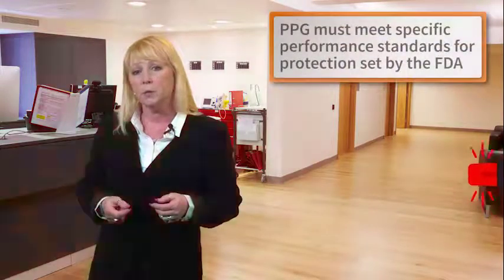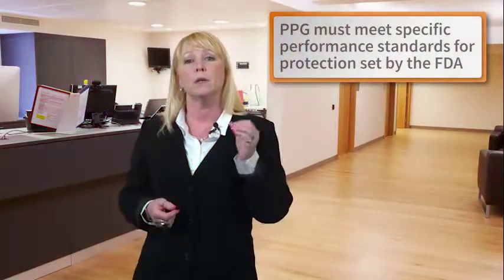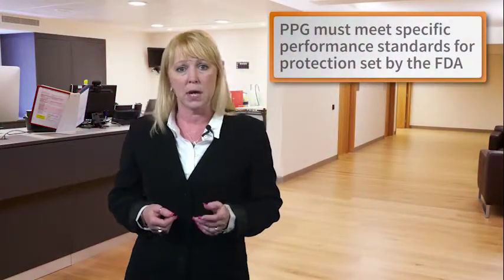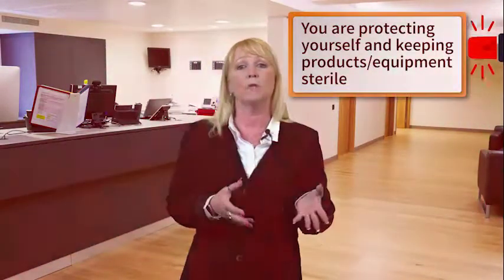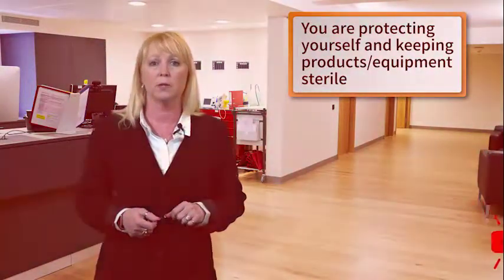All types of personal protective gear needs to meet specific performance standards for protection that have been set by the FDA, which is the Food and Drug Administration. Remember that you're not only protecting yourself, but you're also protecting the products or equipment that you are using.